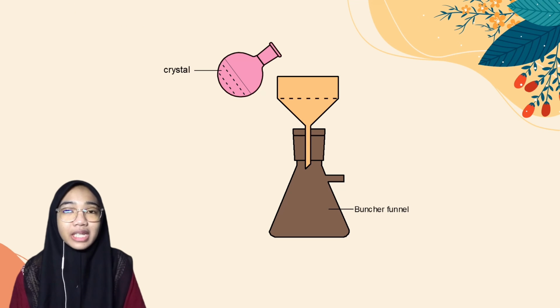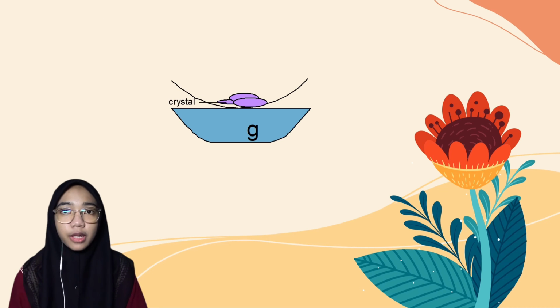Next, we filter the crystals by using a BUCHNER funnel. Last, we weigh the product obtained, which is the crystal.